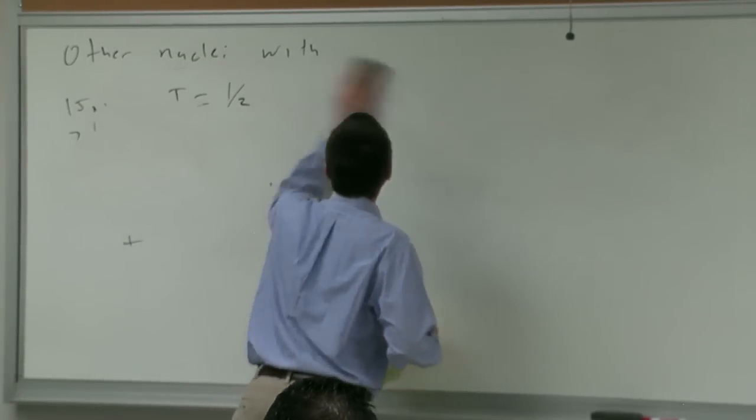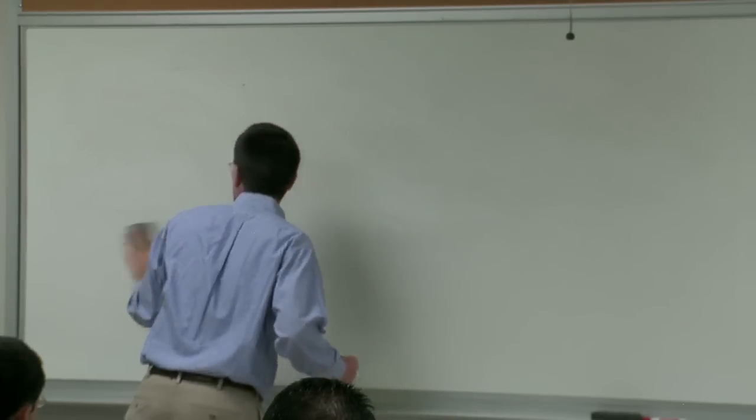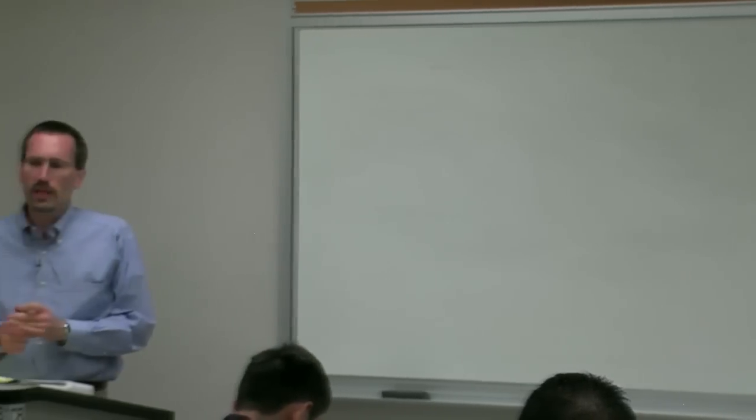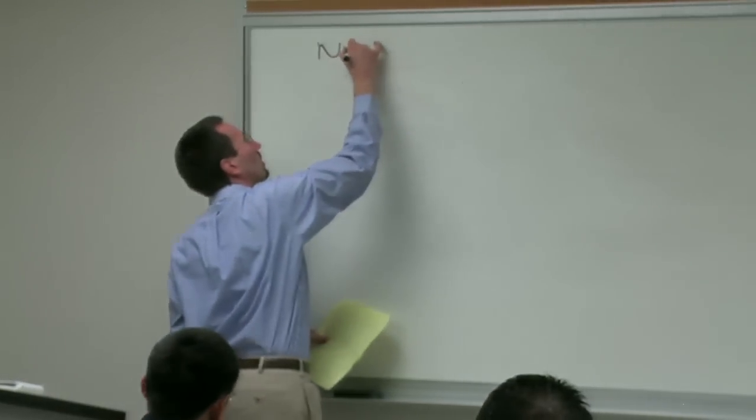All right, most of the time, so deuterium is kind of special among nuclear quadrupoles in that most of the time nuclear quadrupoles, nuclei with quadrupoles, undergo rapid relaxation. But deuterium is special. Its relaxation is slow.